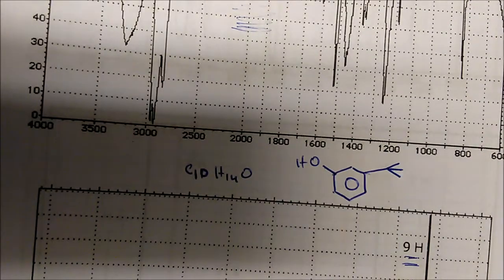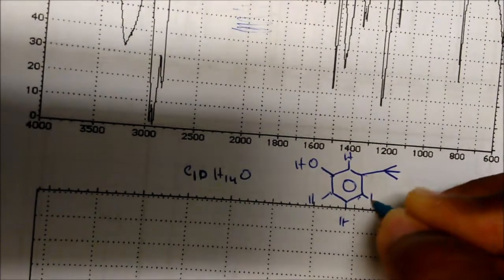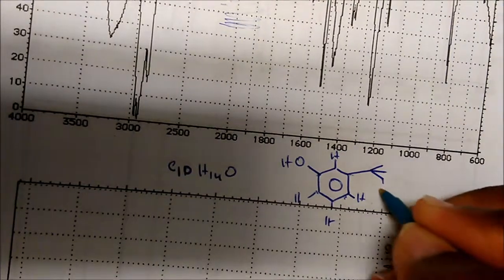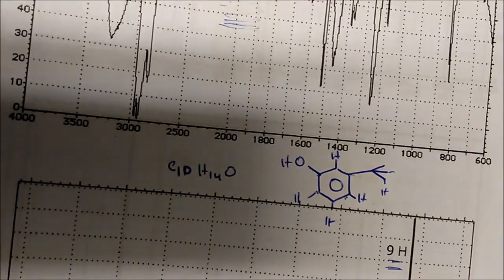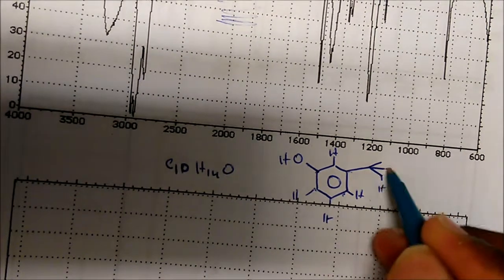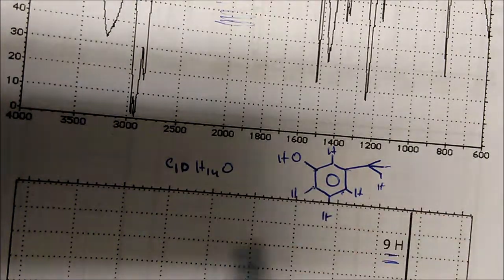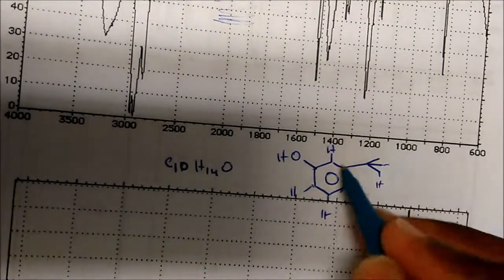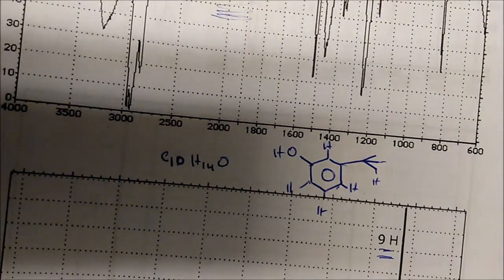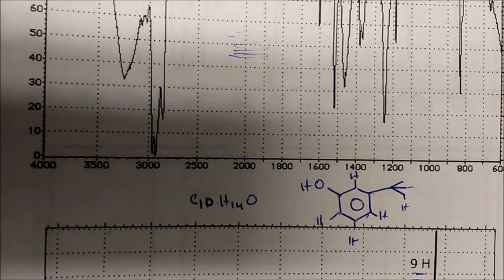Well, we have one oxygen, and we have 4 hydrogens on the ring plus the OH, so right now we have 5 hydrogens, and then 3 hydrogens each on the methyls. So 5 plus these 9 hydrogens here is actually 14. We have 10 carbons: 6 in the benzene ring, and 7, 8, 9, 10. So everything matches. Now with these problems, if one thing is incorrect, the whole problem is incorrect.